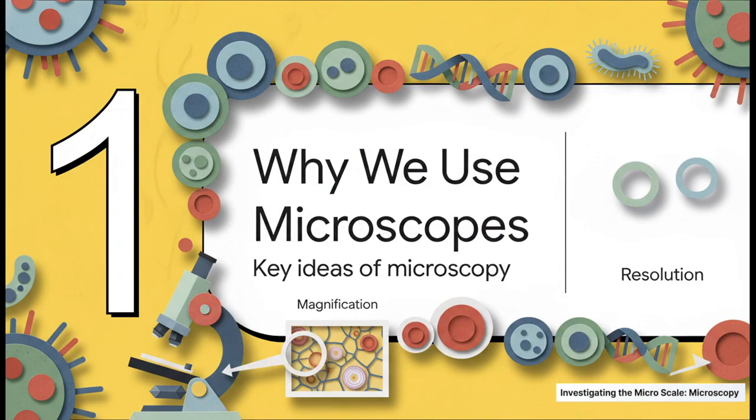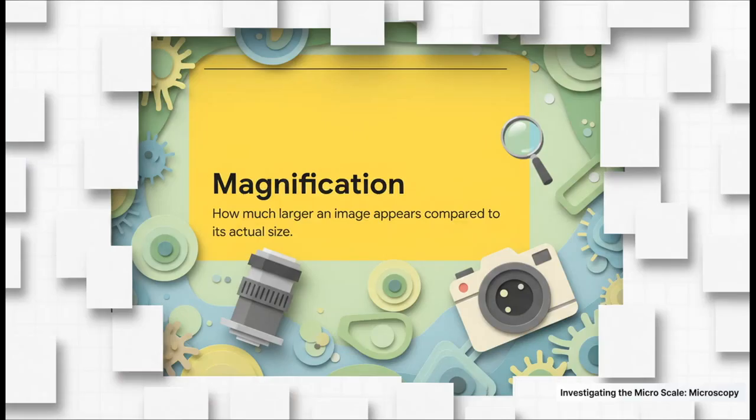Well, it all boils down to two really important ideas you've got to know for your exam: magnification and resolution. First up, magnification. This one's pretty straightforward. It's just how many times bigger the image you're seeing is compared to the actual object. You can think of it like the zoom on your phone's camera.